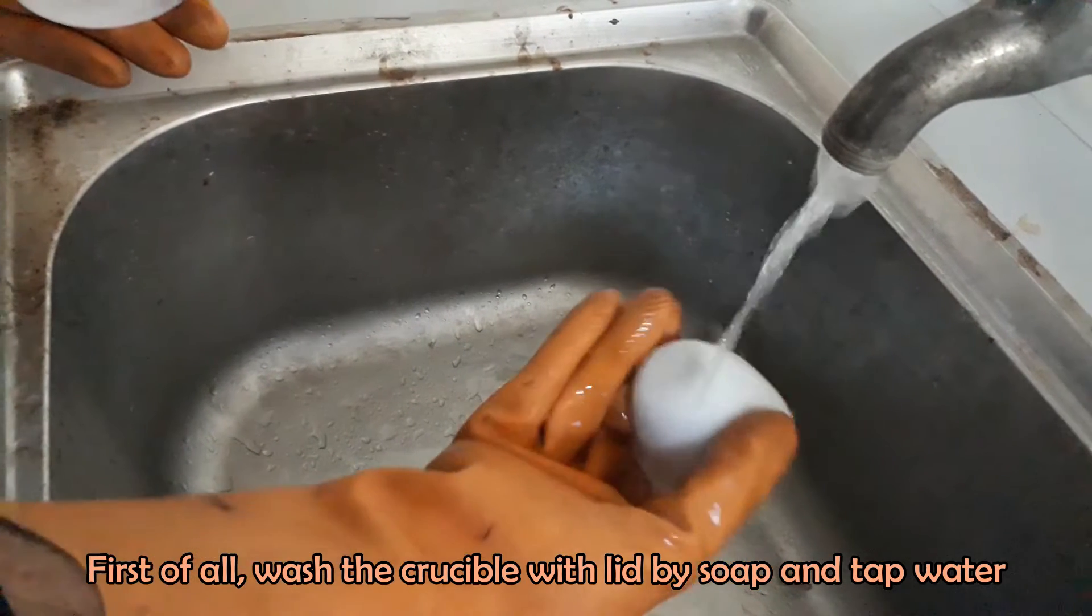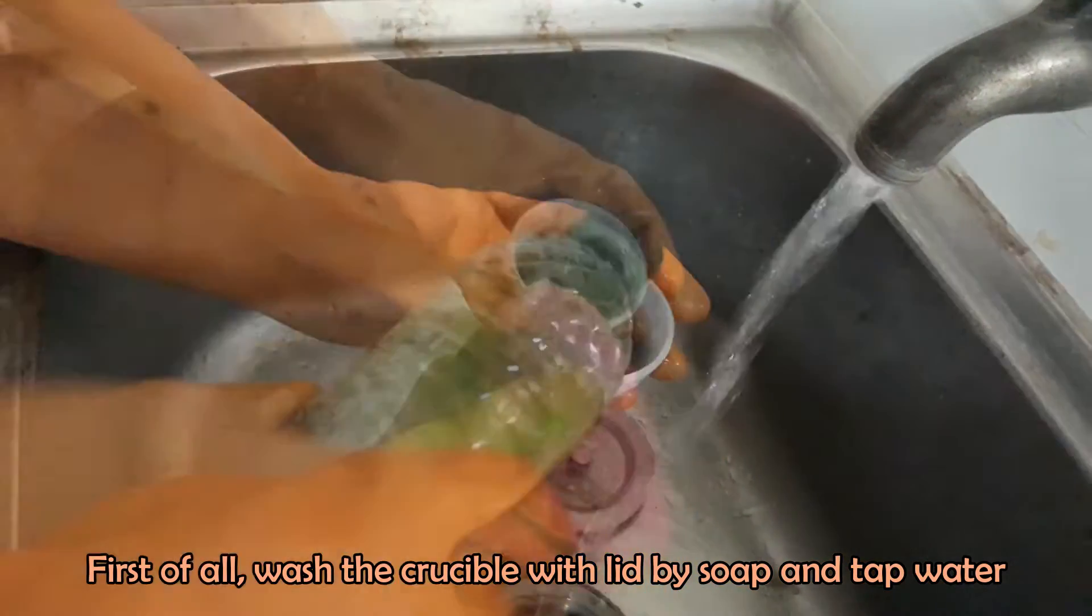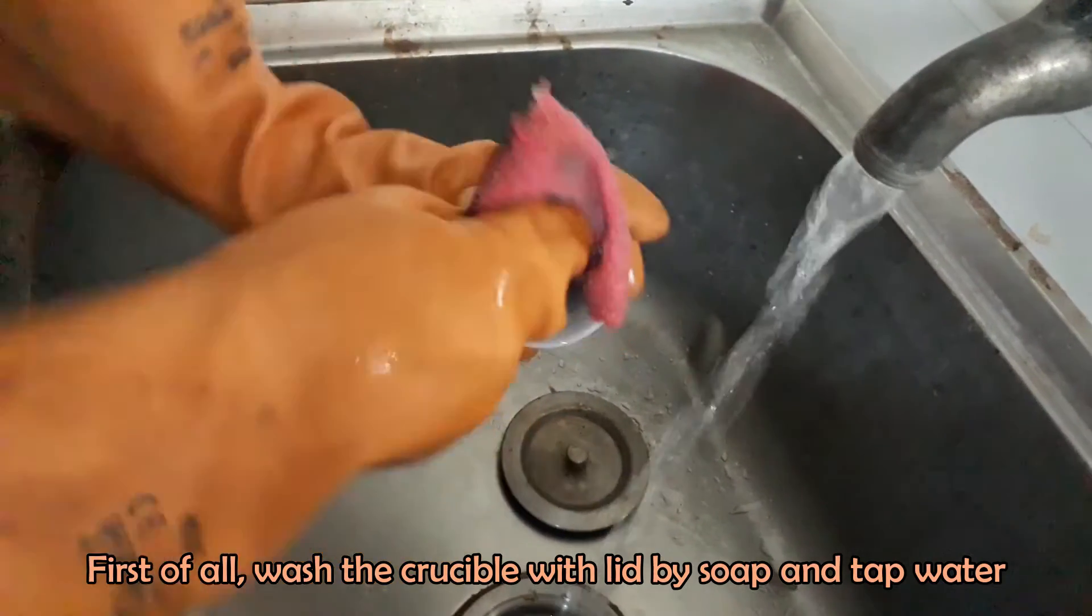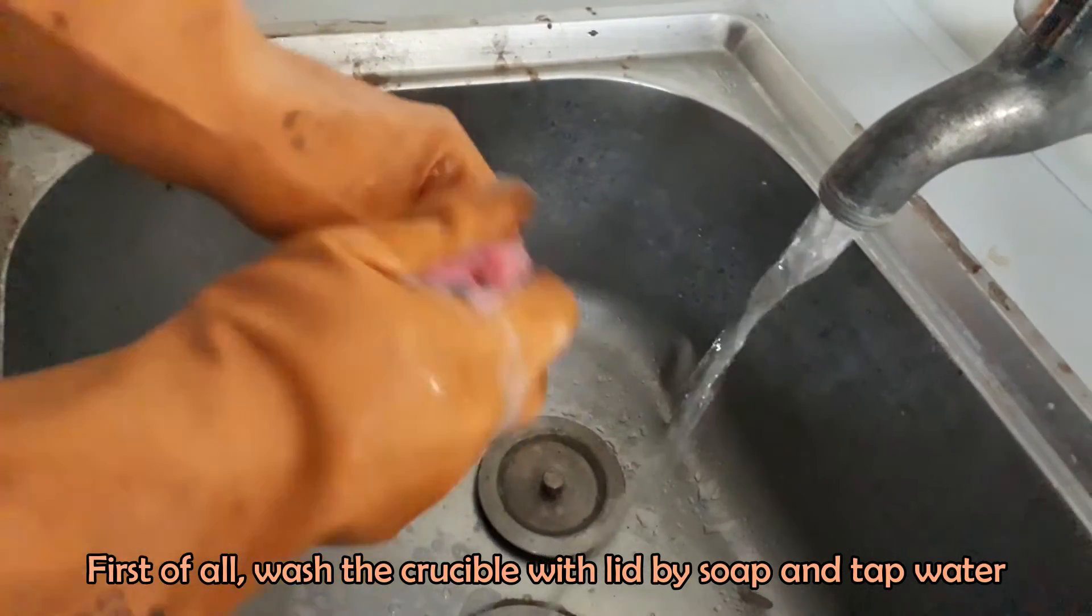First of all, we have to clean and dry porcelain crucible properly to avoid any sort of contamination. Wash crucible with soap, then nitric acid solution, and finally with deionized water.